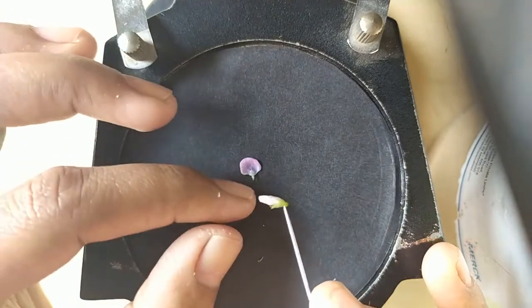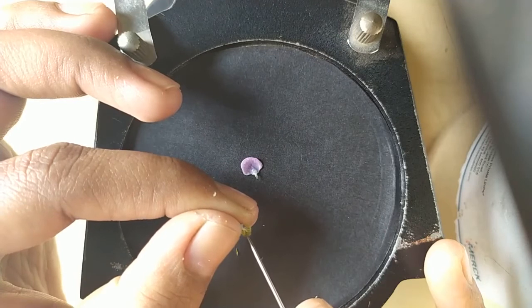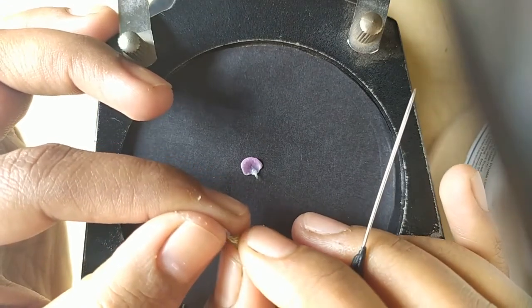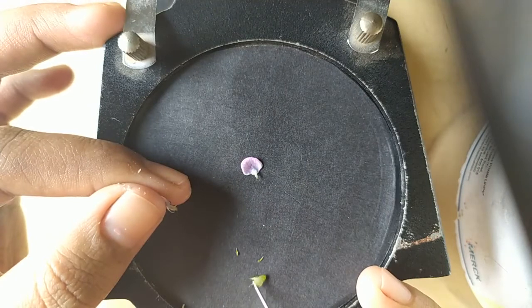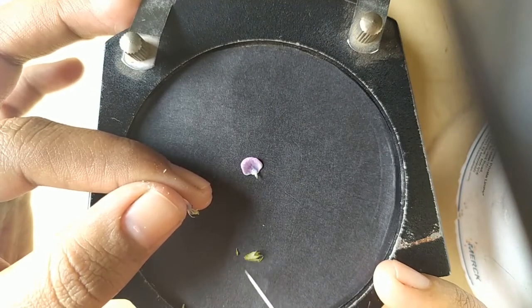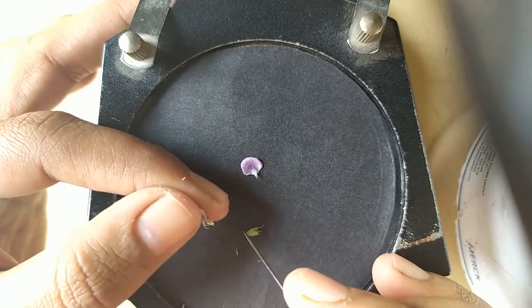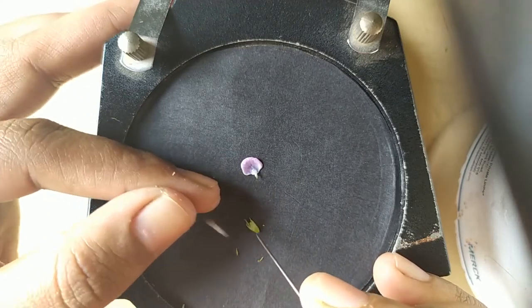Now the standard is removed here. Now our calyx is also removed here. Care should be taken with the 9 plus 1 condition of the anthers, because sometimes the anthers get attached to the calyx.